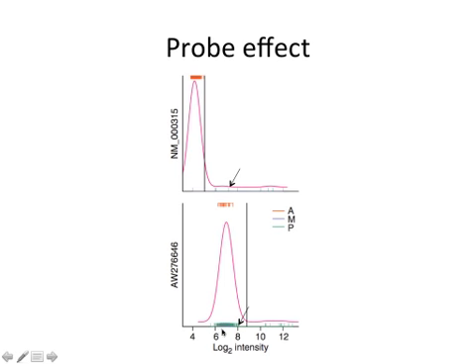but I'm pretty convinced that this is actually not expressed. So remember, this is one gene. That gene is not expressed in most samples. It's expressed in these samples. And here, I would say that these guys are not expressed. All these little ticks, there's a lot of ticks there that you can't see, are not expressed, and then these guys are expressed. So this difference in where the background level is. So notice that the background level, if you agree with me that that is the non-expressed aspect of it, the background level for this gene is at 4.